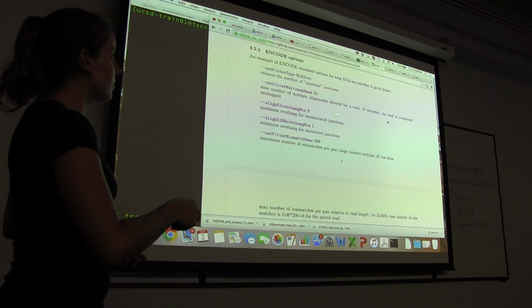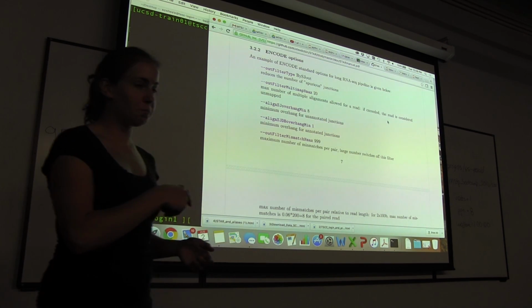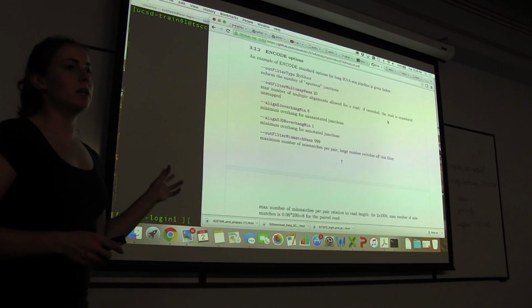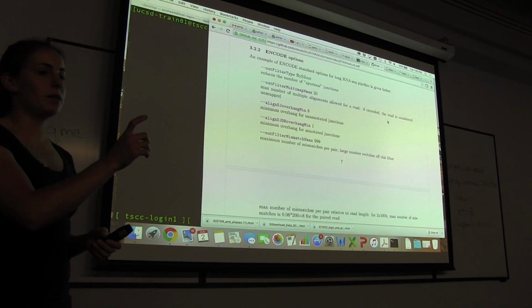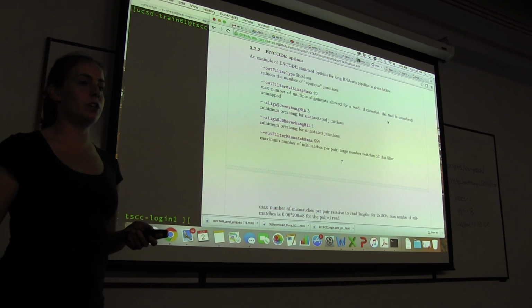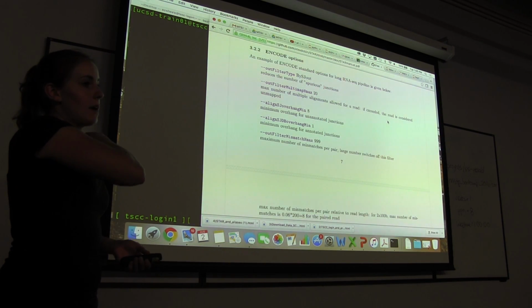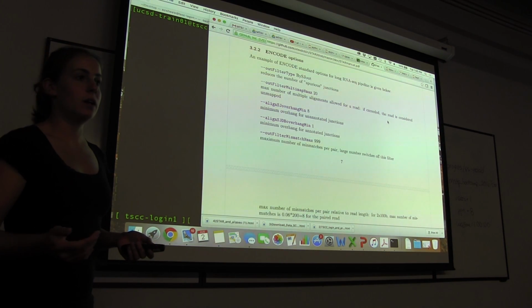This is another really important command. It talks about multiple alignments. So a read with a given sequence can map to multiple locations in the genome. This is particularly important for repetitive elements. So if you have a repetitive element that your read is mapping to, it might map to multiple spots across the genome, and it will be really hard to tell exactly where that was coming from. So some people like to be as strict as possible and say, I'm only going to accept the read if it only maps uniquely to one location.